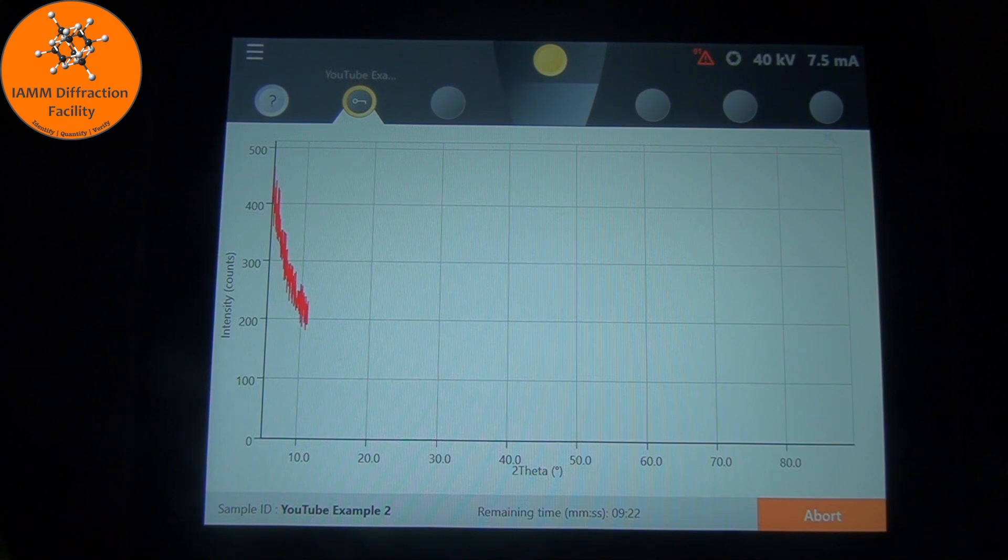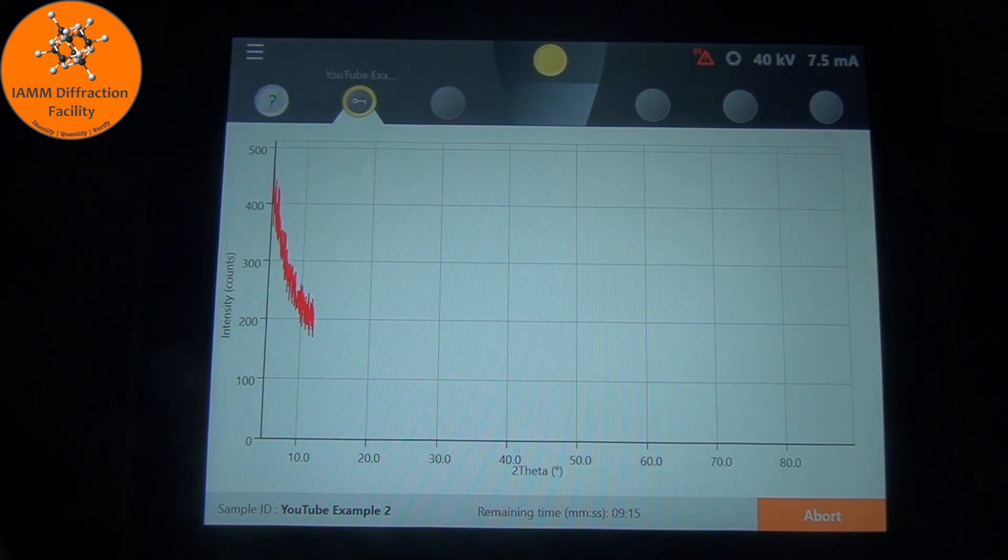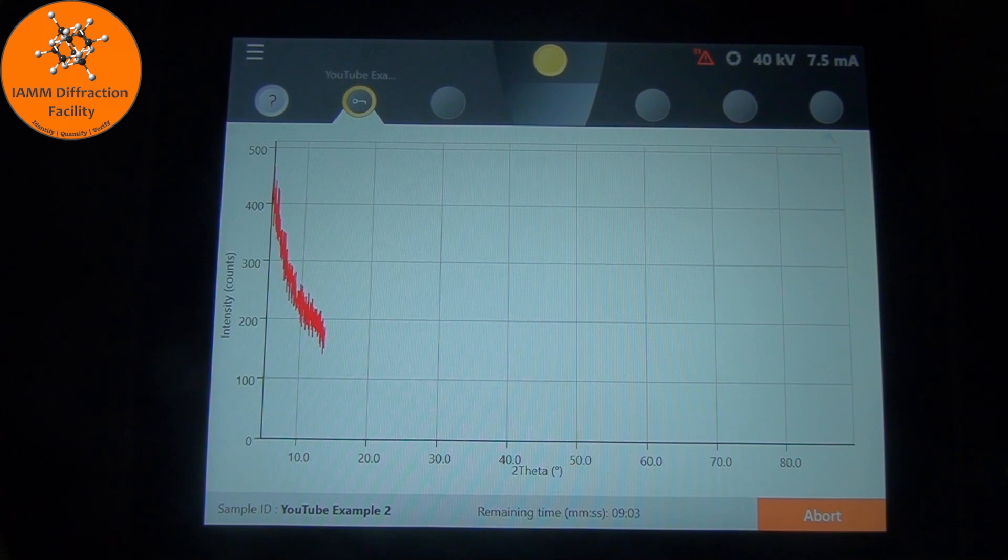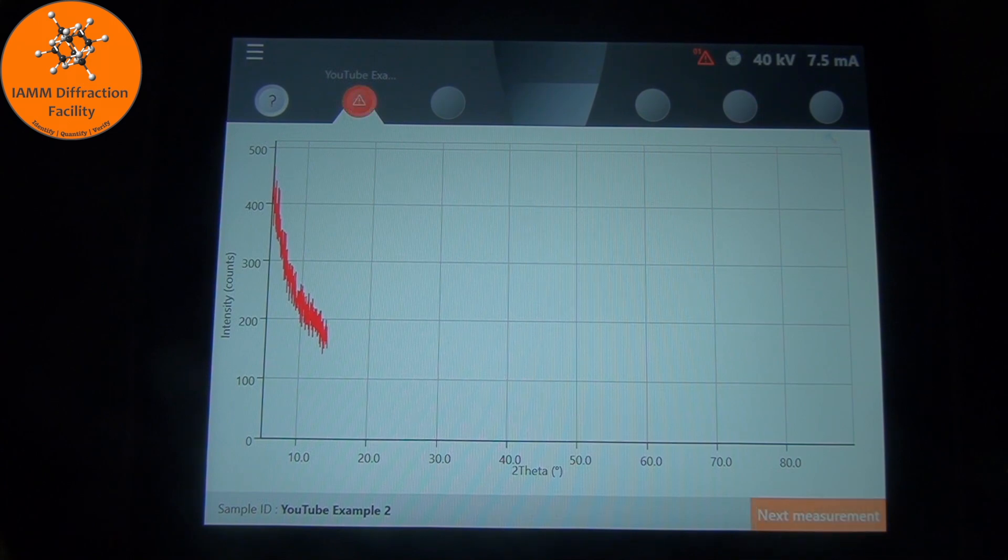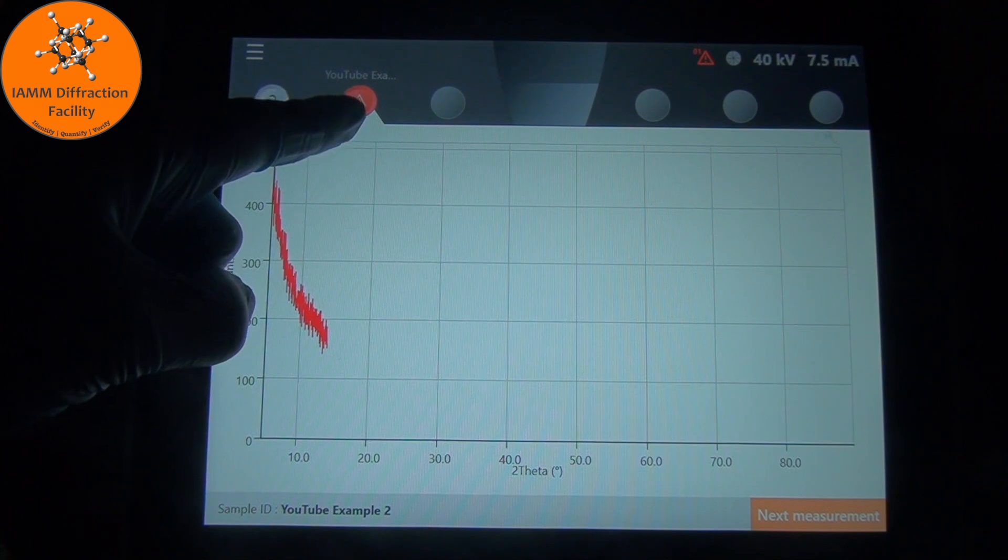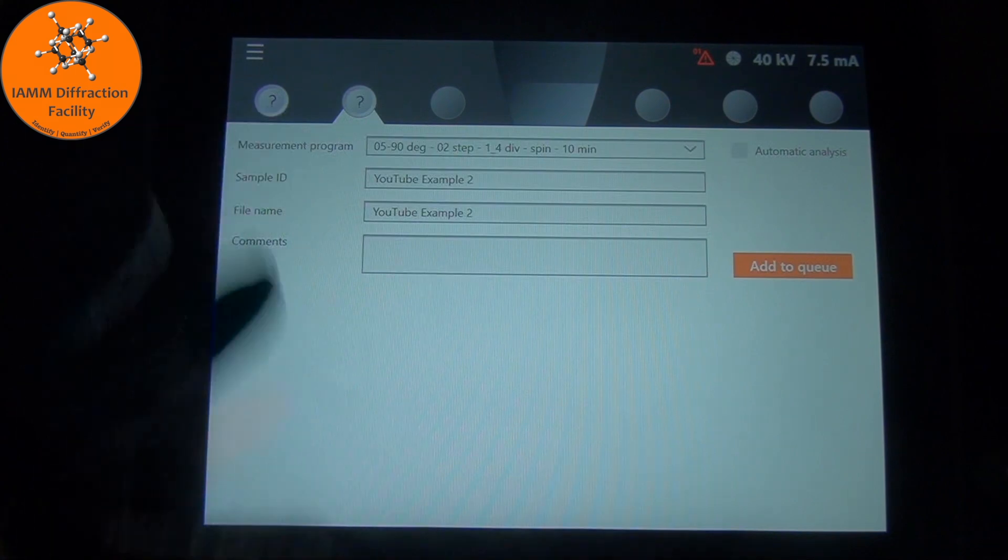We also see that there is a yellow circle here up top. That just means that there is a sample in the chamber running. You'll notice that when there is no sample running, the circle disappears. Let's go ahead and stop the measurement. There is a little red exclamation point just because we stopped measuring. I'll click next measurement just to clear that screen out.